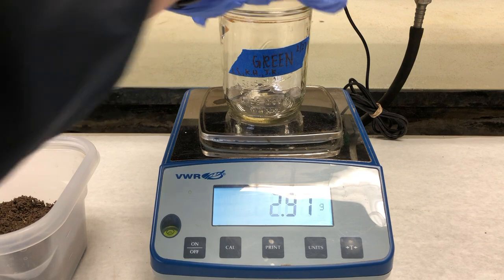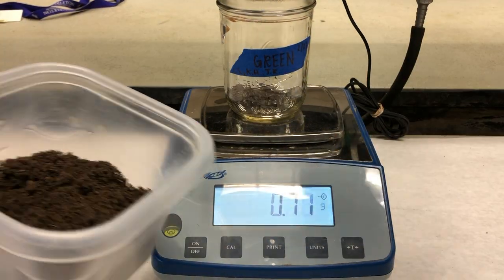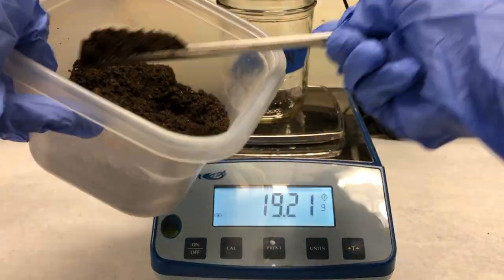Next, place a jar on the balance and tare it. Then weigh 30 grams of soil into the jar, being careful to record the exact weight of soil added. Repeat the process for all three jars.